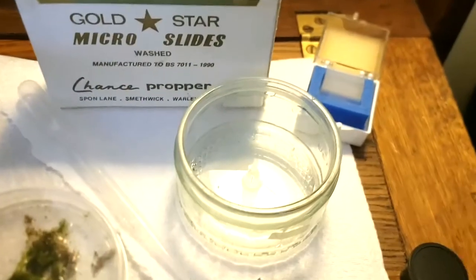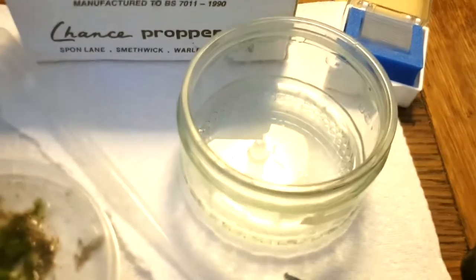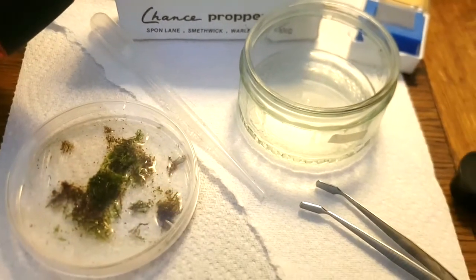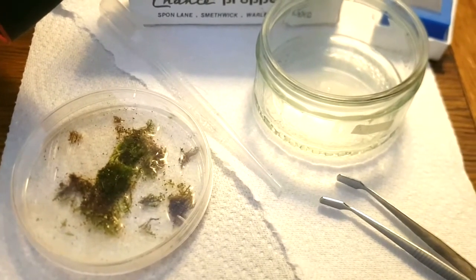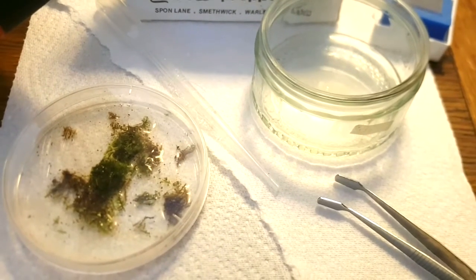This is actually an old jam glass jar that's got rainwater in it. And people think I'm crazy, but when I've been studying microorganisms on a microscope slide, I can't knowingly kill them. So I wash, take the cover slip off, rinse the slide into that pot, and then I will go and pour that back over by where I isolated the moss.